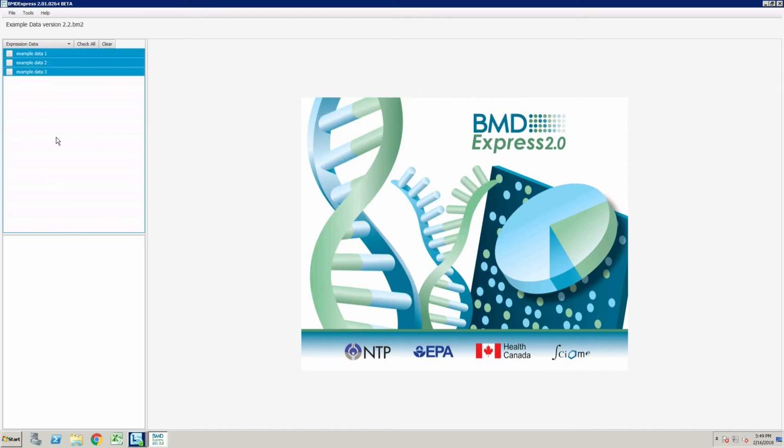So I have already run the Williams trend test, and that's the data that I'm going to use. So imagine I have run this data, I run the Williams trend test, I go down here now and I select Williams trend test, and here are my results. And I get very informative file names. This is data 1, Williams trend test, p less than 0.05 was used, there was no multiple testing correction applied, and there was a fold change filter.